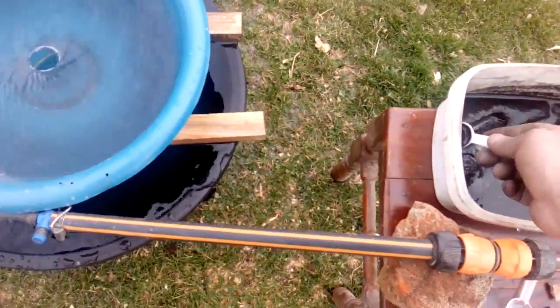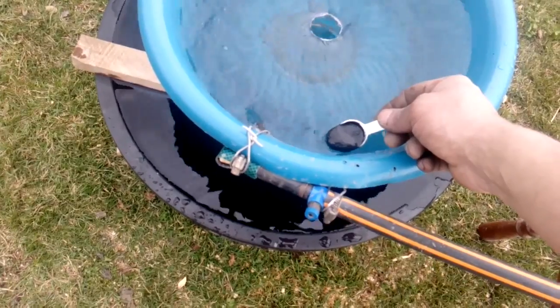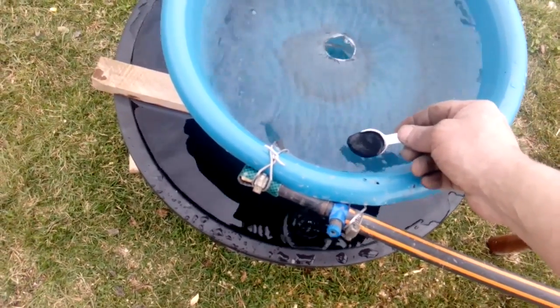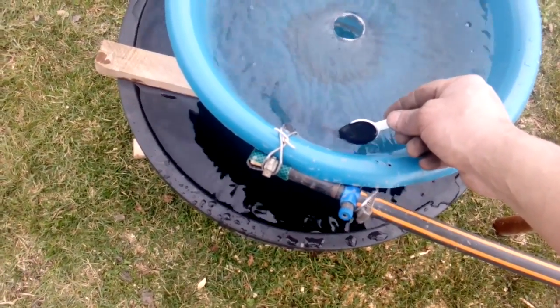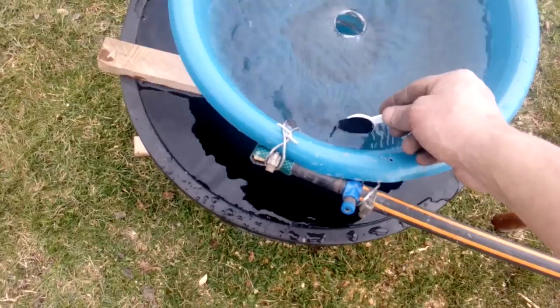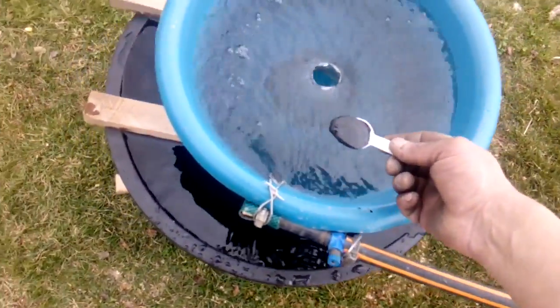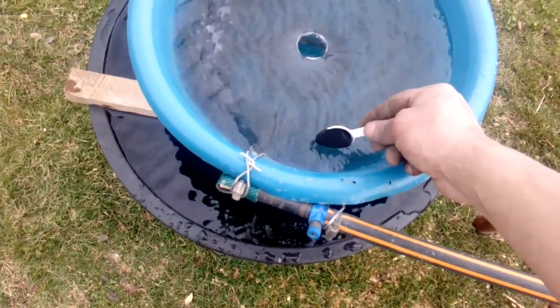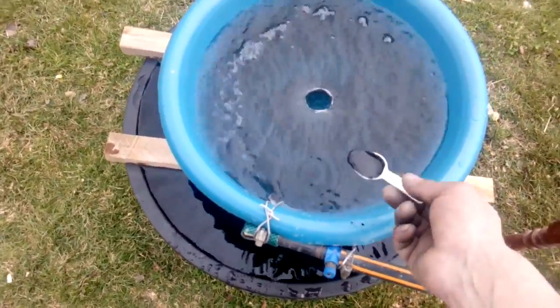I want to thank a couple of guys whose videos helped me to learn and improve my gold recovery hobby. I want to thank the Urban Miner Francois, Moose Scrapper — this is the best guy — and Ev's Ben, Mike McInister, and a lot of other guys. Now we'll put all the black sand in the bowl, and when I finish, I keep going with the process.